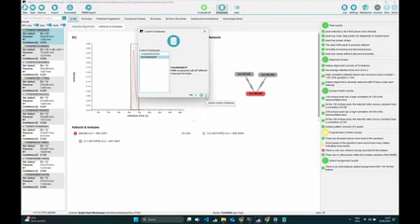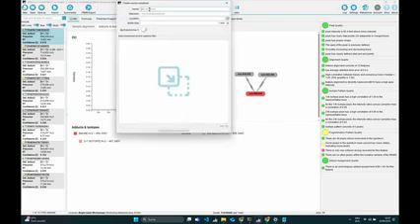And the other option is to create a database, and then you give it a name, say where to store it, and you drag and drop your different file formats that are specified here. For structures you just have TSV, and for spectra you have the typical spectral library formats. They are all listed in the documentation. All right, thanks.